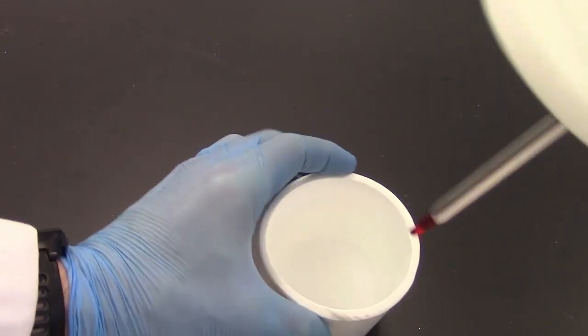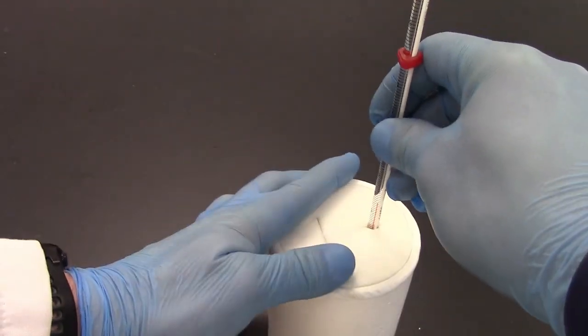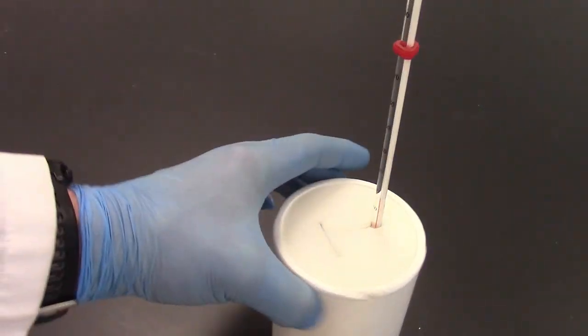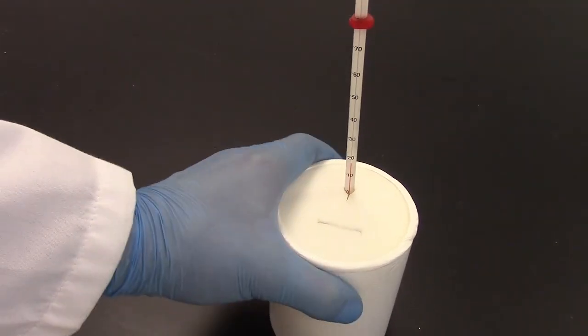And then I'm going to insert it into my calorimeter here and I'm going to make sure that the tip is touching the water level there. So it should look just like this. And I'm going to set that off to the side.